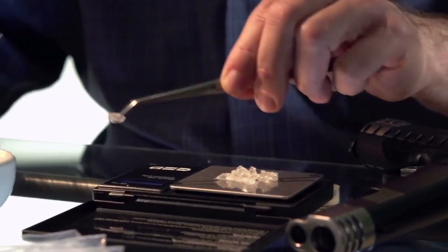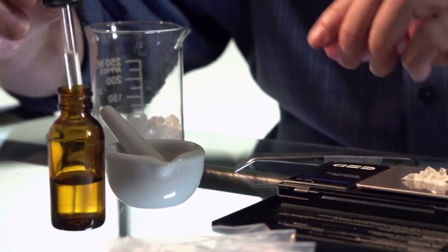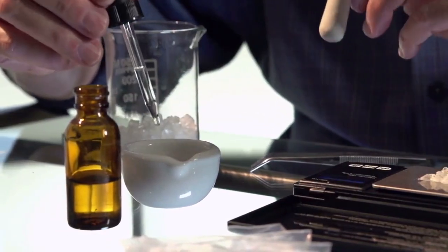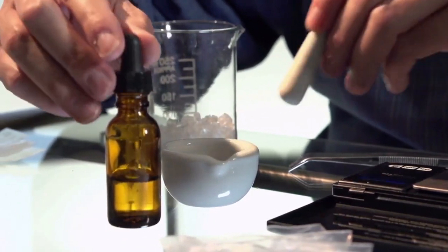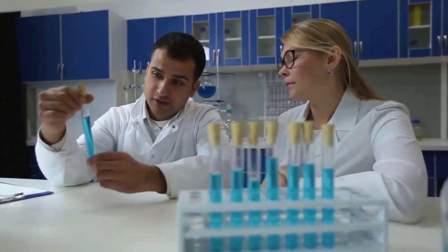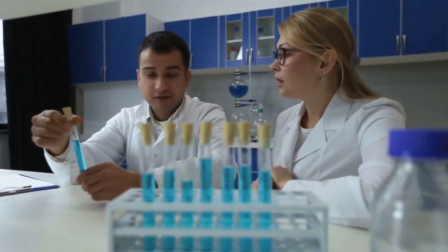For instance, if your main peak area is 950 and the total area of all peaks is 1000, your purity is 950/1000, which equals 95%. This simple calculation assumes that the detector responds the same way to all compounds, which is a good approximation for many routine lab analyses.